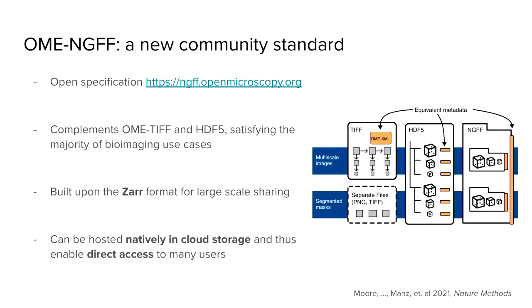With the goal of satisfying a lot of these issues in bioimaging, and specifically bioimaging at scale and sharing of data. OME-NGFF is built on top of the Zarr format. So you might hear me say OME-Zarr throughout this presentation. The two, for the sake of this presentation, are interchangeable. And a very important aspect about this format is that it can be stored natively in cloud storage, and thus it opens up direct access to many more users.